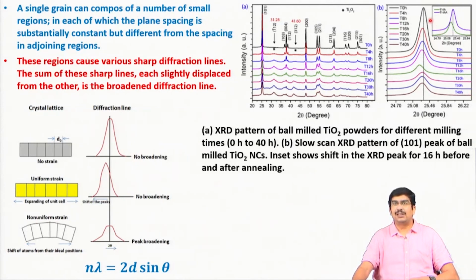So, what we are able to see is that without the milling, this is the peak position. Exactly at the Bragg's condition, the moment we started the milling, now the peaks are getting shifted, the intensity slightly decreases, but the more prominent effect is peak shifting towards the left. So, there is a considerable amount of macro stresses generated in the material at the starting.